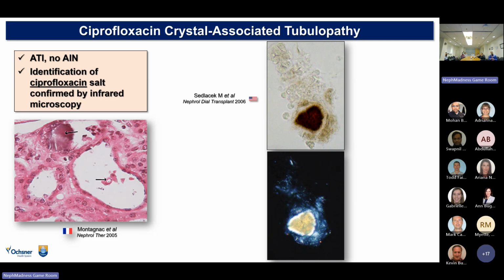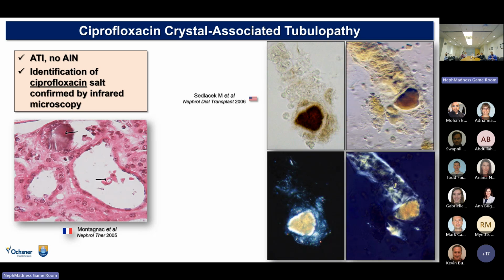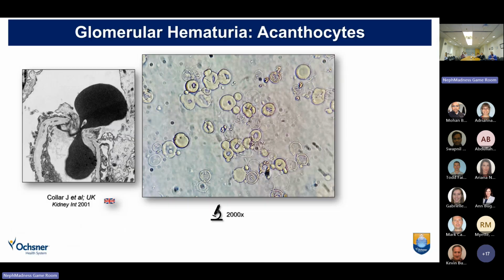The patient had AKI, and they found this crystal and called it ciprofloxacin; the top image is by bright field, the bottom image by polarized light. And this is a crystal that we have found in our laboratory, almost identical. So it's really reassuring when the findings are pretty consistent. We're pretty certain that these crystals constitute ciprofloxacin medication.